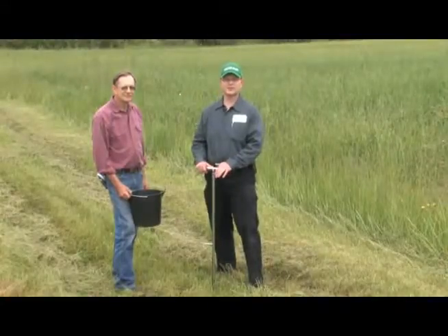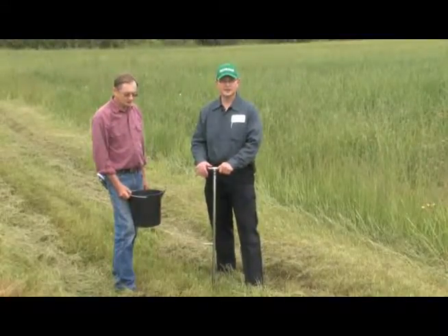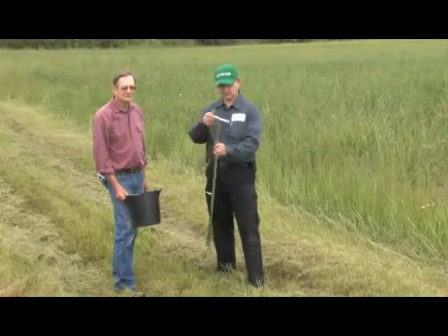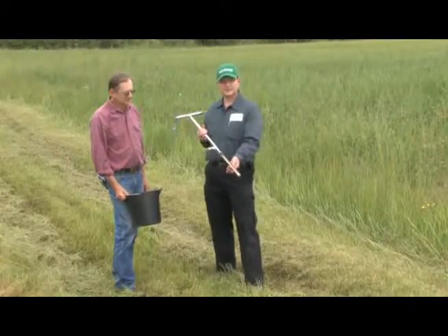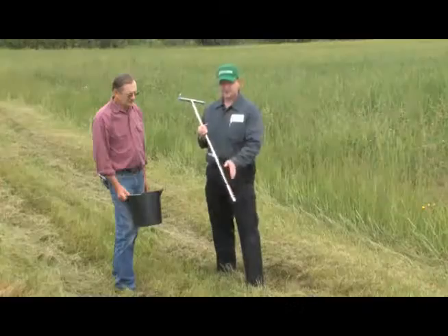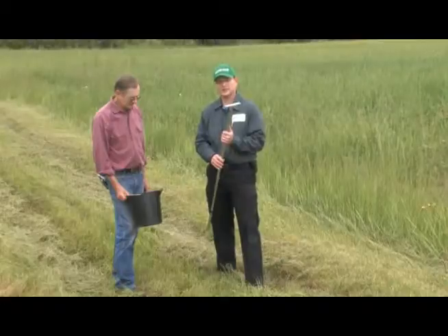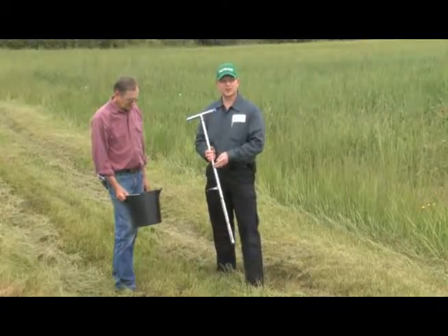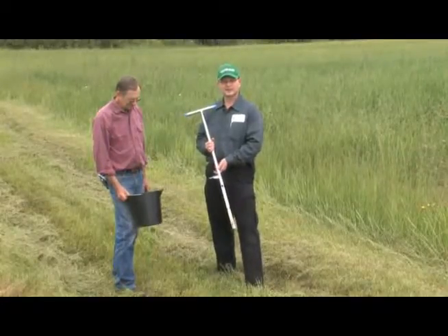One of the tools that you may find useful is a soil sample probe. You can obtain soil samples using a shovel or spade, but a soil sample probe, which I have in my hand right here, we have marked off at 6 inches for a normal depth of a soil sample. These probes can be stainless steel, or also they can be chrome plated, or you can even make one yourself. But from an industrial or scientific supply house, you can obtain these for about $75 to $100.